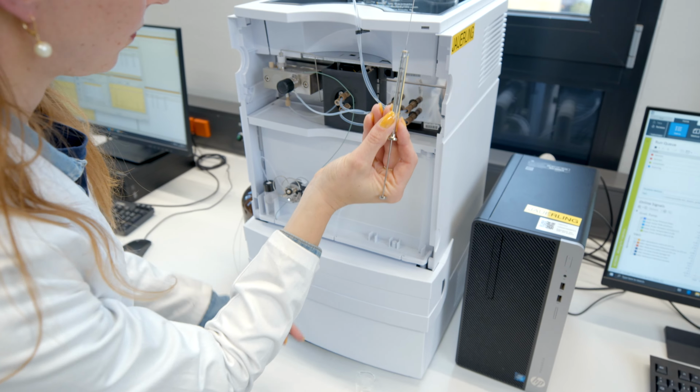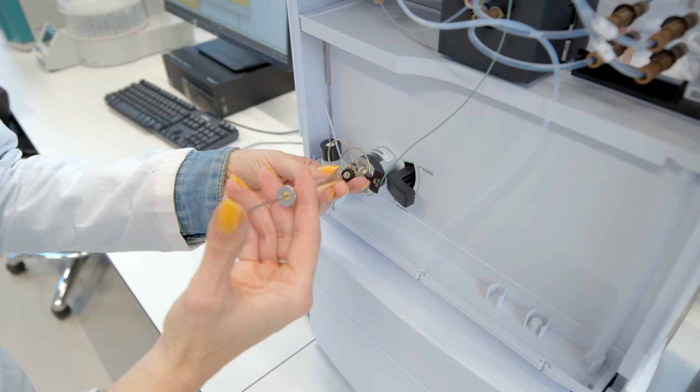Hello everyone, welcome to our short laboratory room that is dedicated to the instrumental analysis. My name is Anna Melchenko. I'm lecturer and researcher at chemistry program at IMC Krems. I'm a professor of analytical chemistry, and I'm looking forward to showing you around in this laboratory room equipped with state-of-the-art devices. Now you can see here the HPLC device, high performance liquid chromatograph.